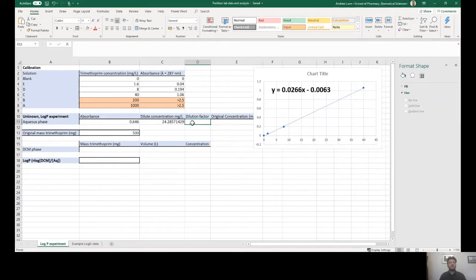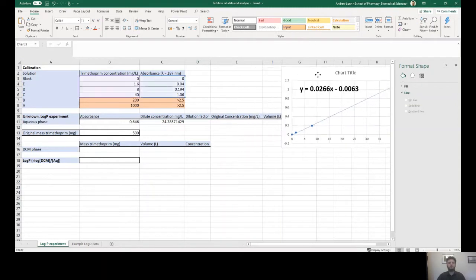Now remember, we diluted this sample so that we could take the reading in the UV-vis. That's because the concentrated sample may well have been too concentrated to get an accurate reading. And remember, if we go too concentrated, we effectively blind the UV-vis because you block all light going through, and some light needs to get through for the UV-vis to work effectively. And in the experiment, if we refer back to exactly what we did, we will see that we took 5 millilitres of the sample and diluted it to 100 millilitres.